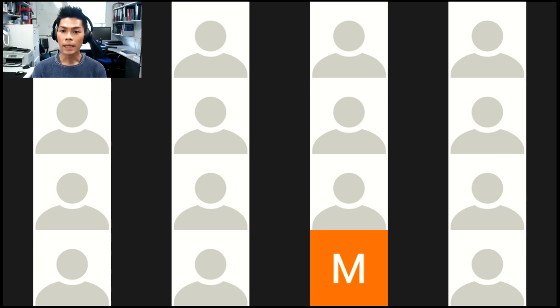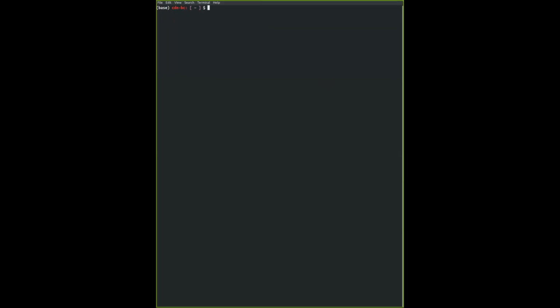By the way, don't worry. We're going to go through the code right now. When you're ready, you can open up Terminal on your Mac or Git Bash if you're on Windows. I'm going to share my terminal right now. All right, I hope you can see my screen. I'm going to adjust my screen a little bit to make sure that I can see the chat up here and any reactions. Okay, so I have the chat, I'm ready.